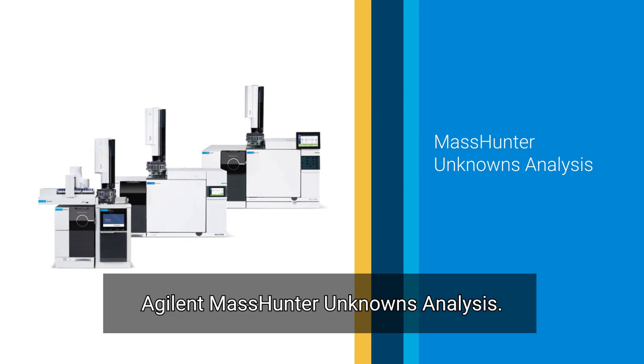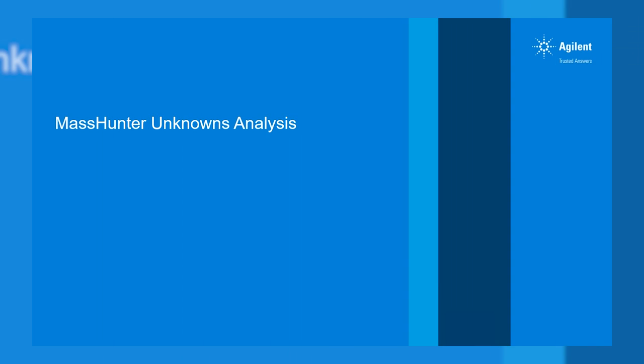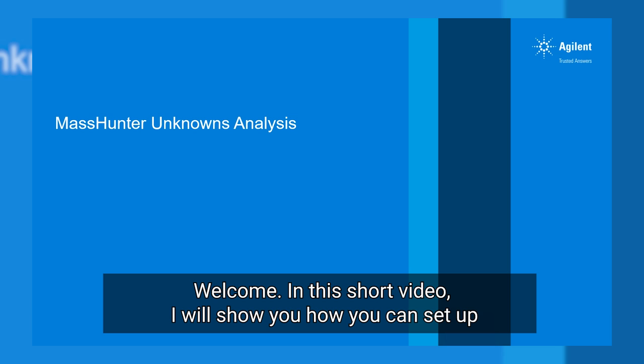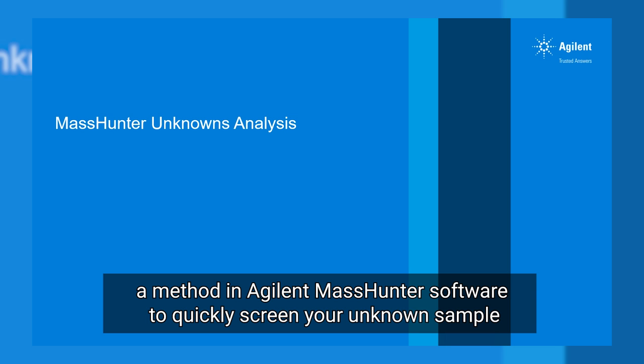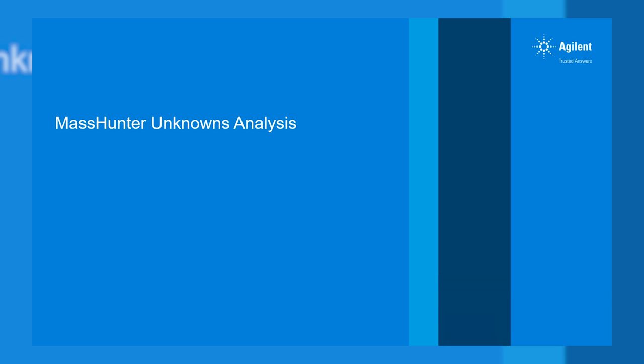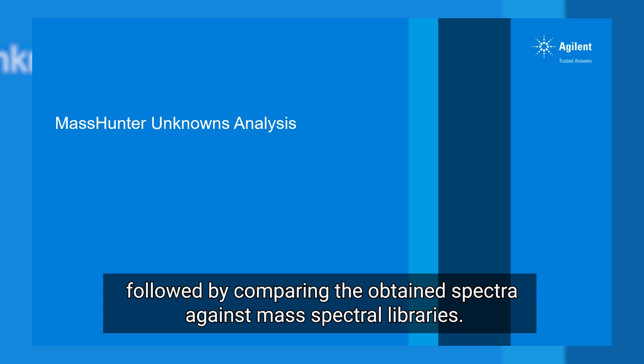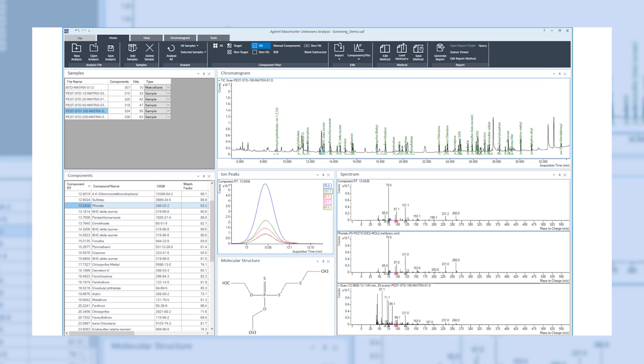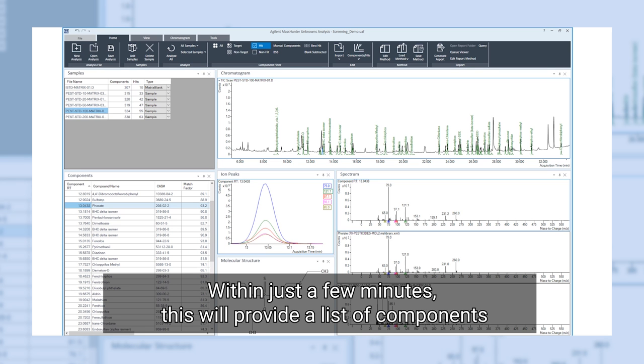Agilent MassHunter unknowns analysis. Welcome! In this short video, I will show you how you can set up a method in Agilent MassHunter software to quickly screen your unknown sample by applying deconvolution to detect the individual components in your sample, followed by comparing the obtained spectra against mass spectral libraries.